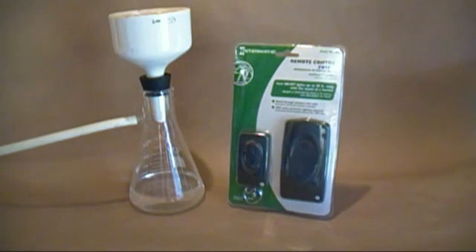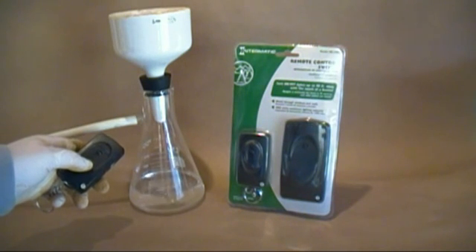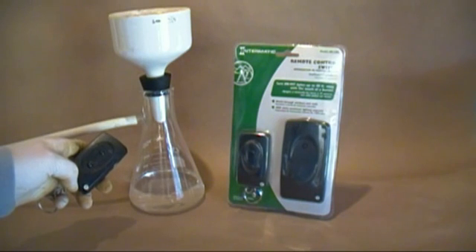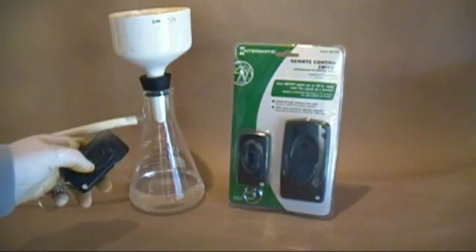I would love to have an eagle I could yell to to flip the power switch to whatever contraption I've invented. However, I can't afford to pay his health insurance cost. So these remote-controlled power switches are the next best thing. I have one hooked up to my vacuum pump six feet away and can turn it off and on at the filter. It saves me a lot of time and exercise.